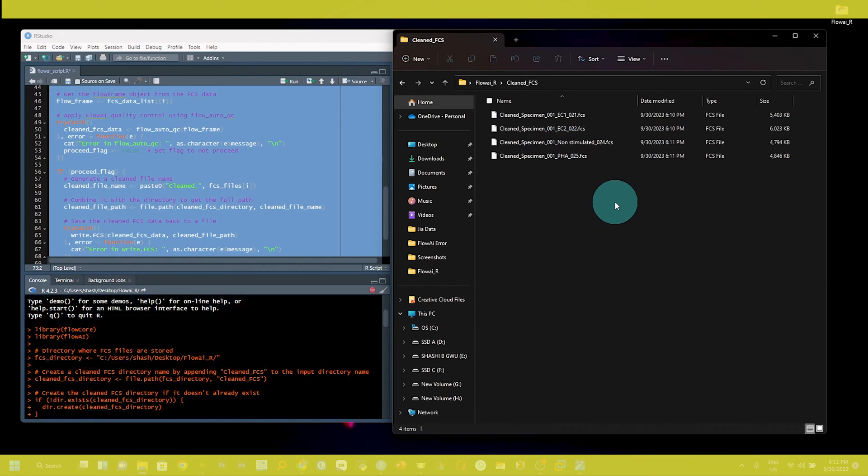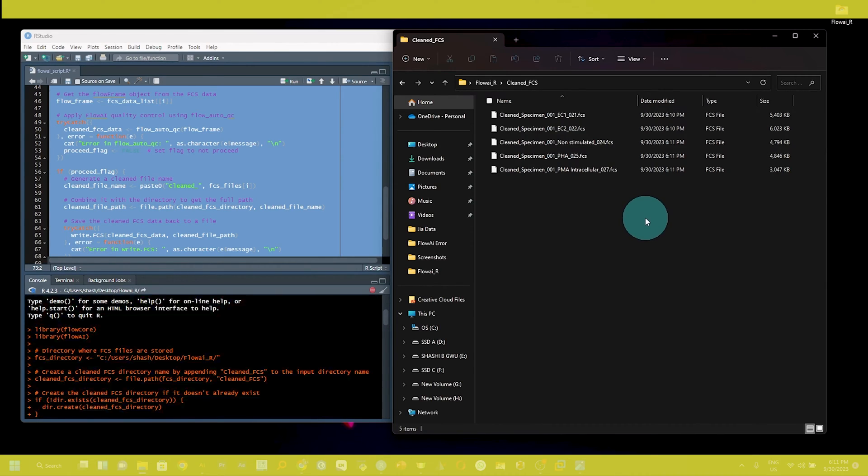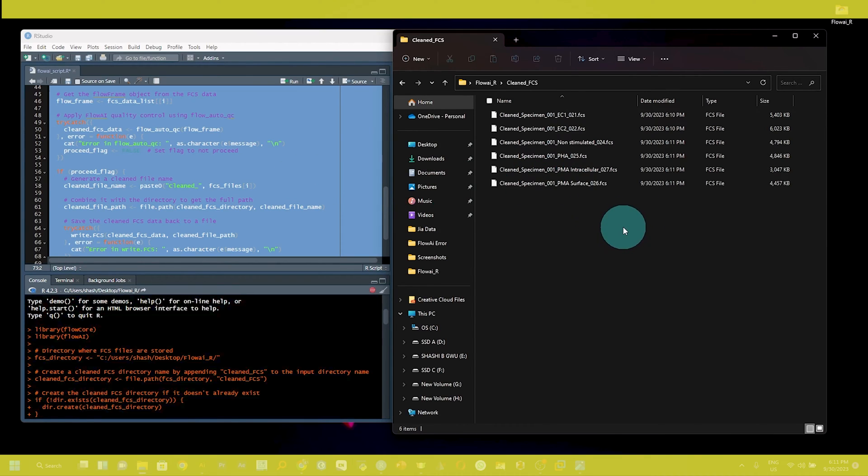That's why it is very important using the R package in R so that you can save your time. If you are doing a large experiment and you have multiple fcs files, you can clean using the R script.